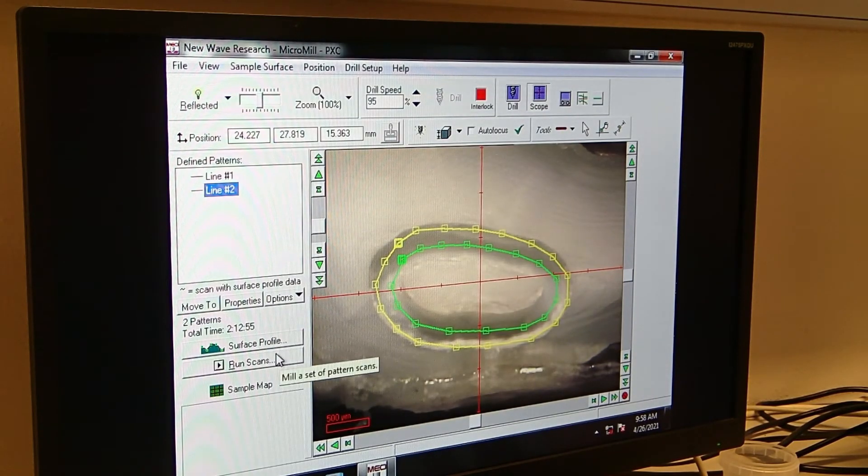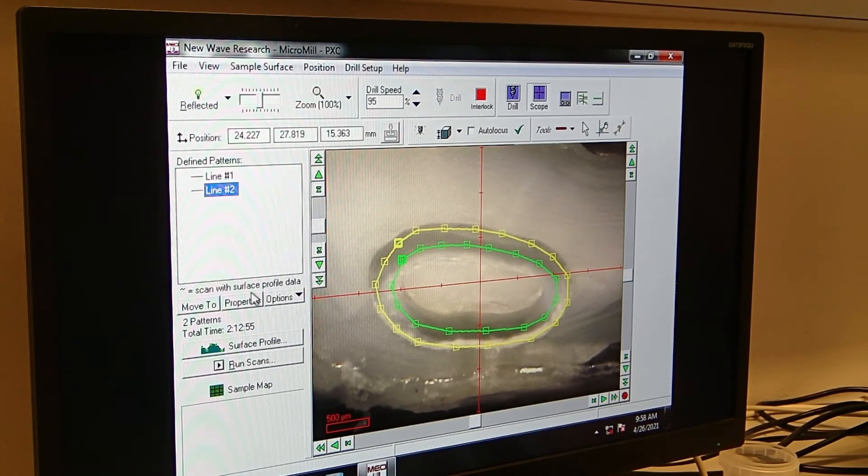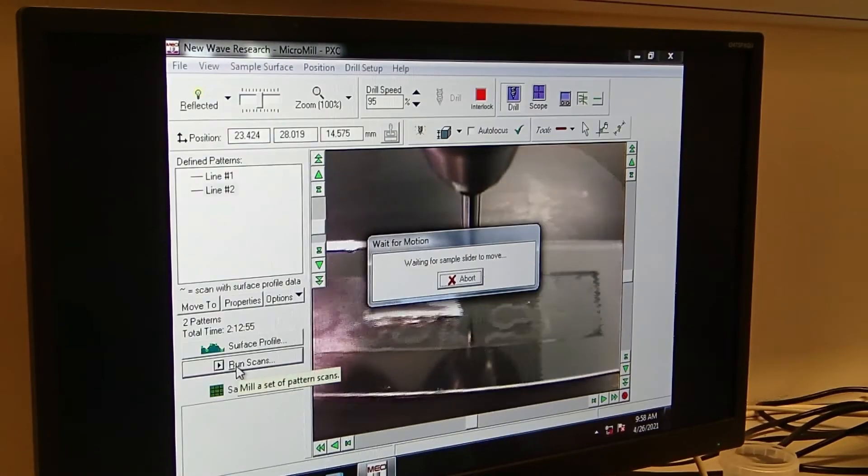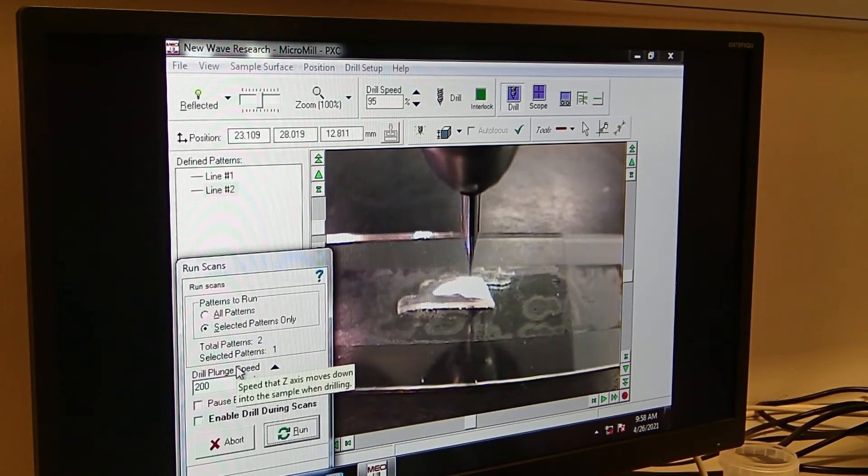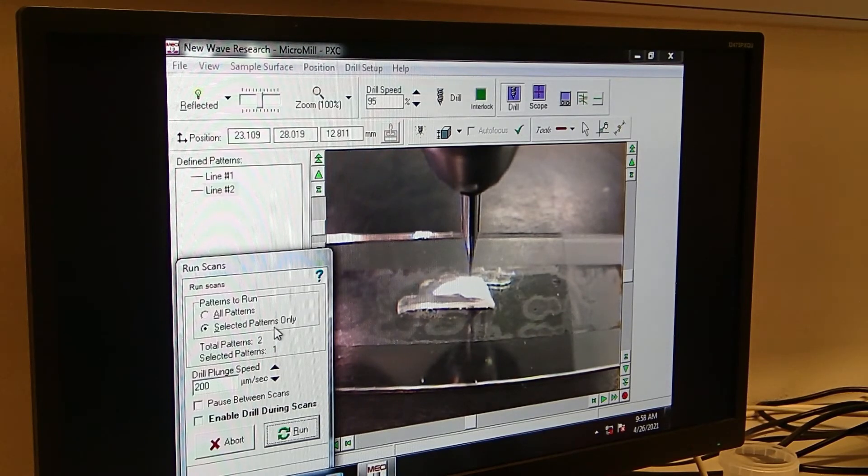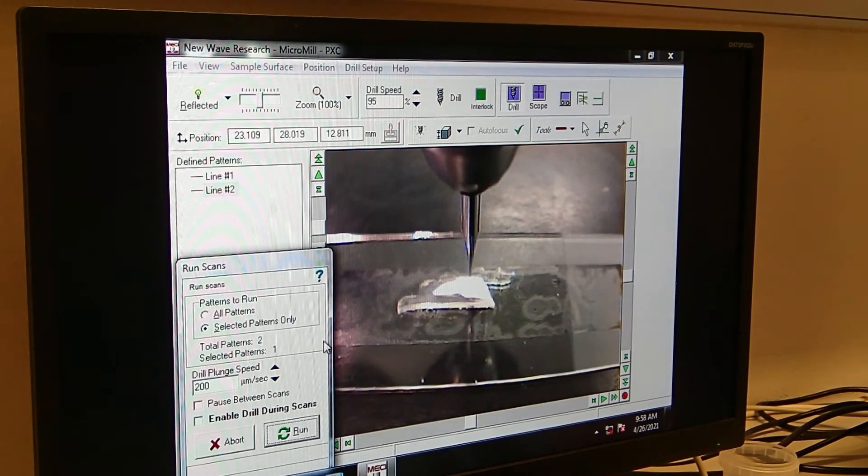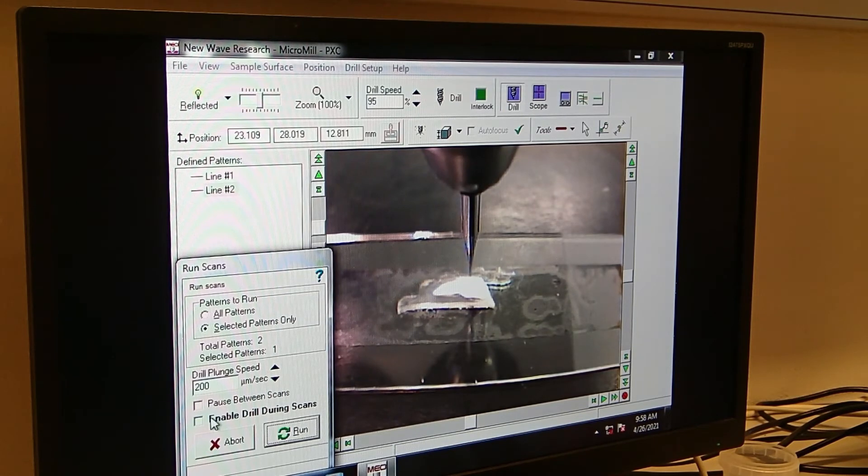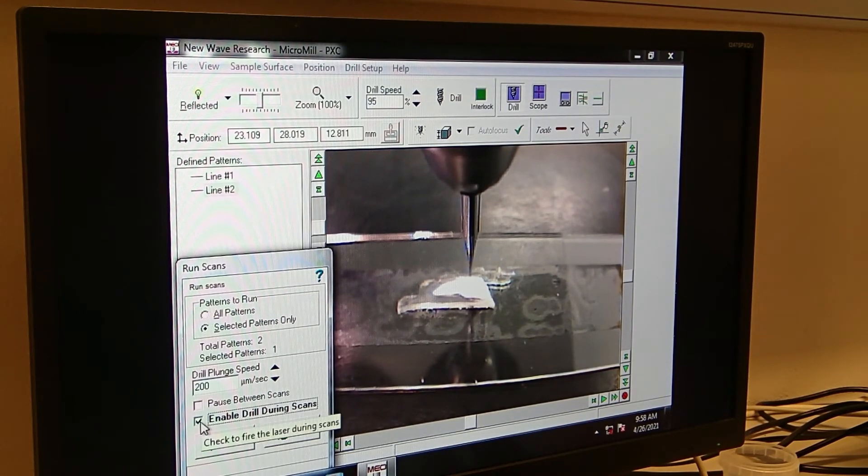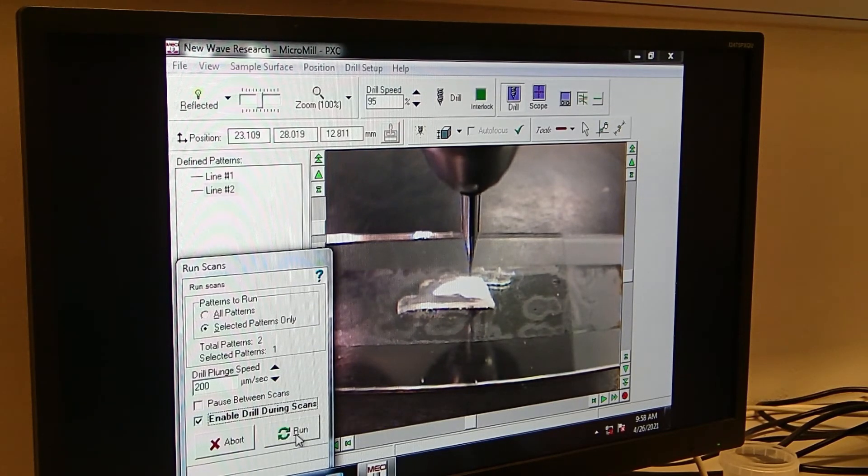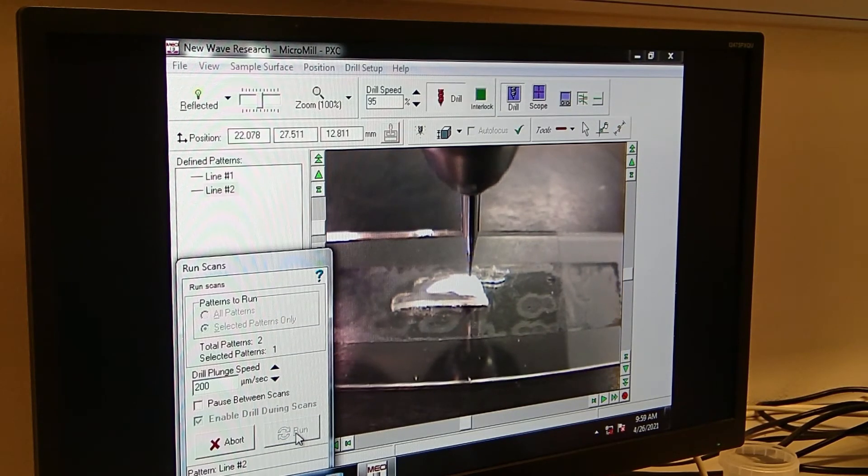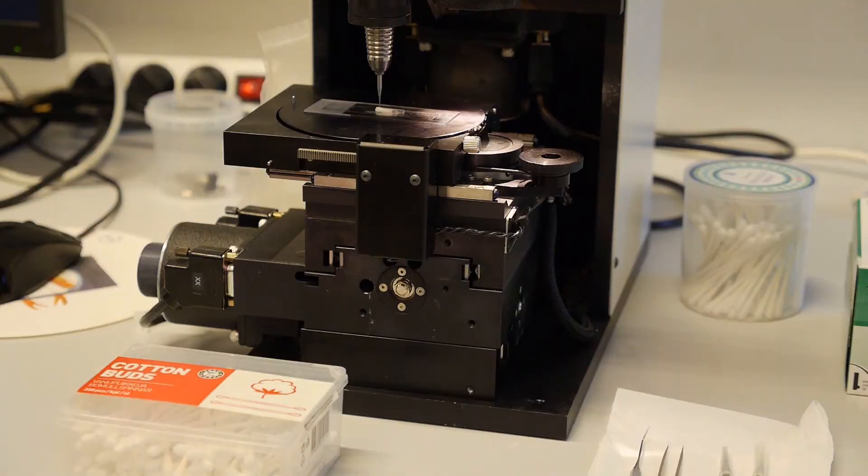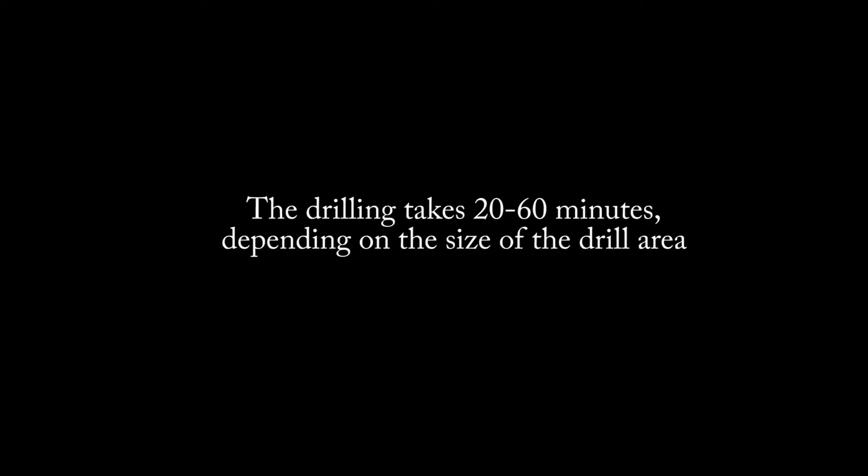Then we actually want to start the drill. So still line two, we say here one run scans. And here it is very important that you just choose selected patterns only, otherwise it would drill both lines. And then, so this is always unchanged, the 200 micrometer per second. And then you just click enable draw during scans, which is very important. Otherwise it's just scanning it but not actually drilling. And you can start one. And now the micro mill is drilling the sample.